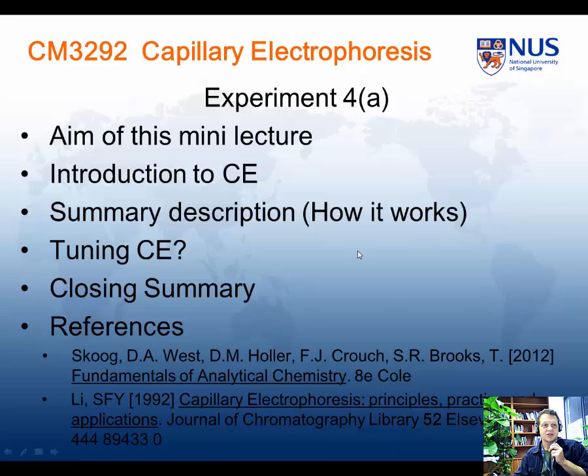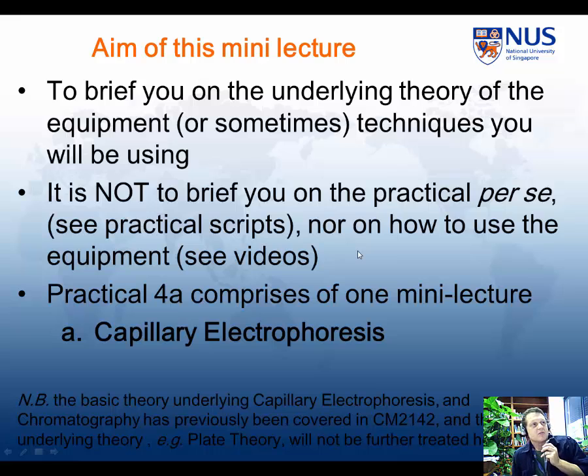Okay, so again, broadly as in other lectures, this eLecture is not about how to do the experiment. That's why you've got the experimental script. There are references in it, so for instance we're using a particular type of electrophoresis, capillary zone electrophoresis, therefore we'll talk about it.